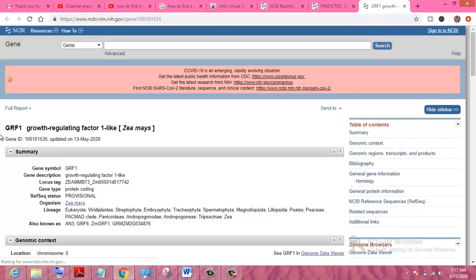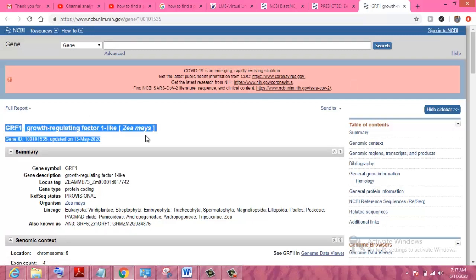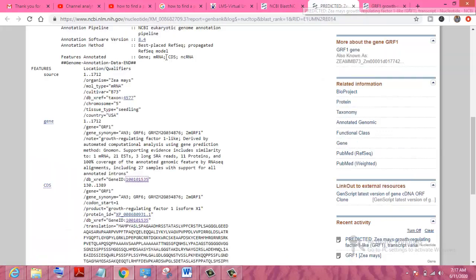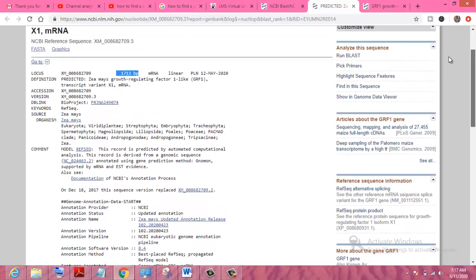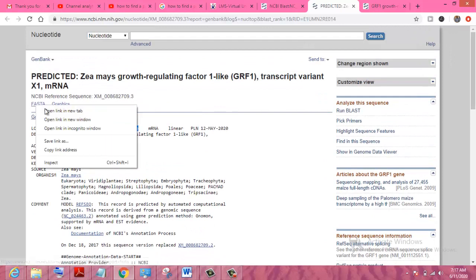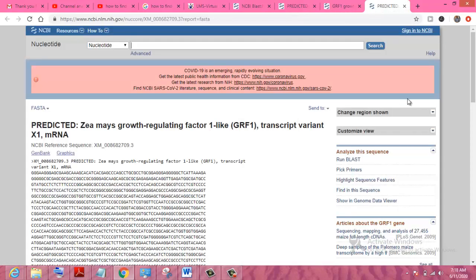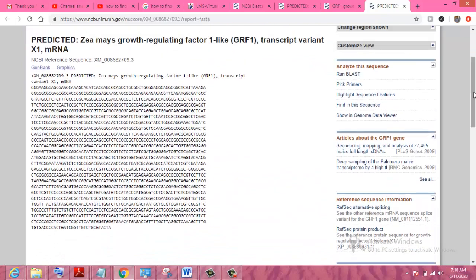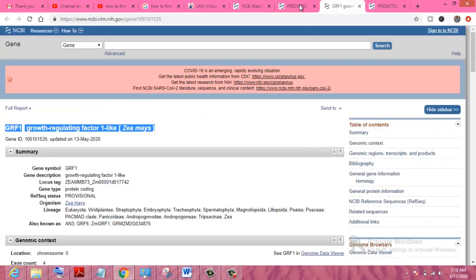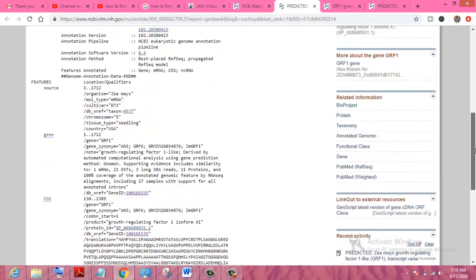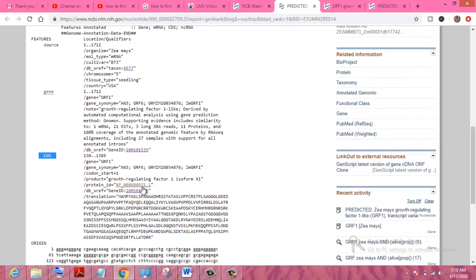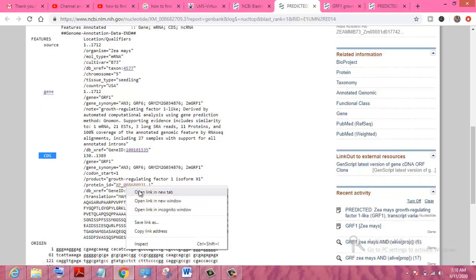Here you can see these are the same results — this is the same gene GRF1 growth regulatory factor in Zea mays. Here we will find the protein sequence of this gene. You can also find the FASTA format of this gene. For finding the protein sequence, go to CDS — CDS is available — and click on the protein ID, which will open in a new window.